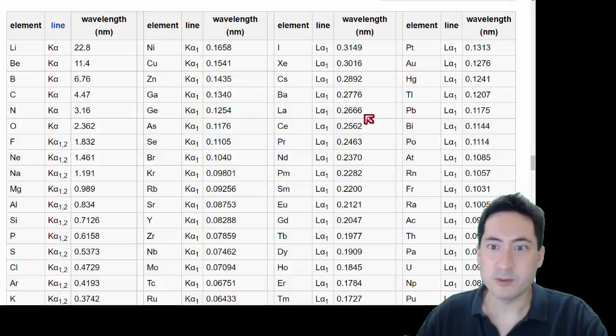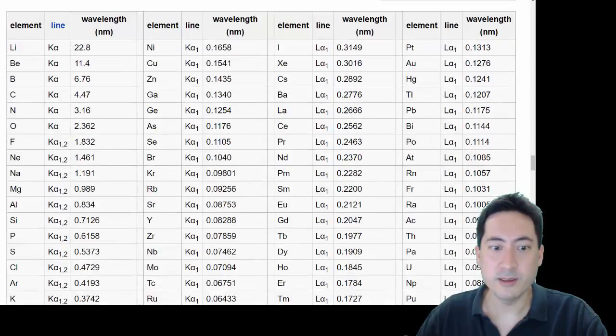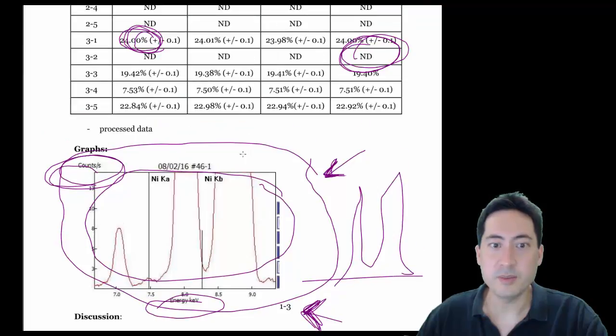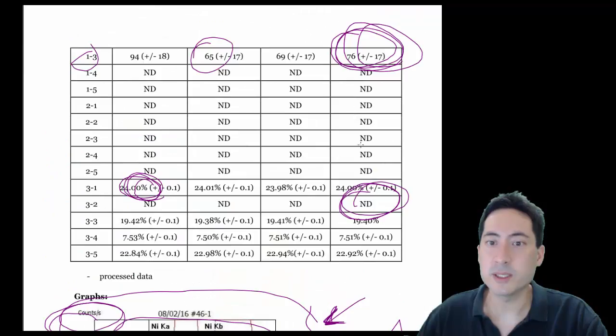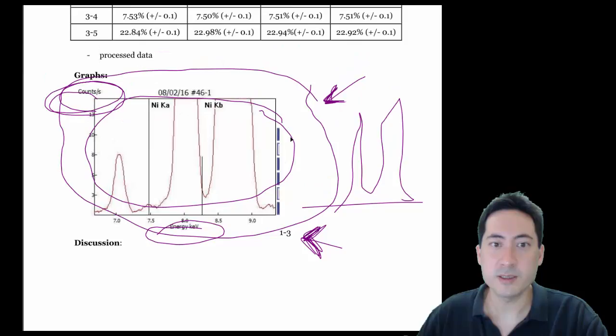And here we have probably some referencing as well, some reference lines. Alright, so prove to me that this here is nickel. Put that referenced in there somewhere. That possibly, if you had a calibration and a standard, a positive control, that can probably give you some percent error to add to your random uncertainty, so you covered on those bases as well.